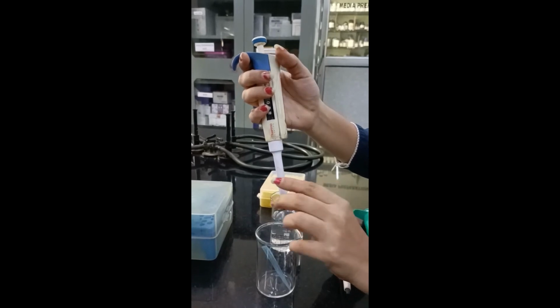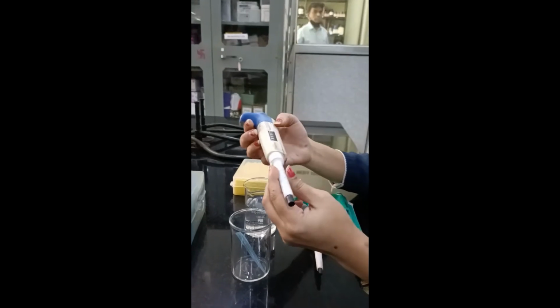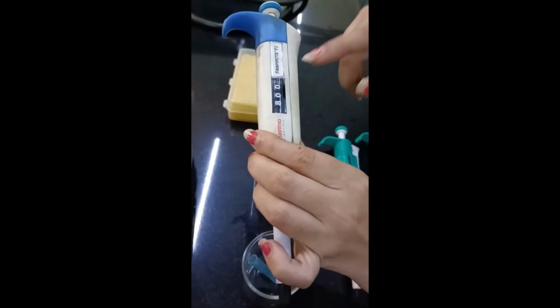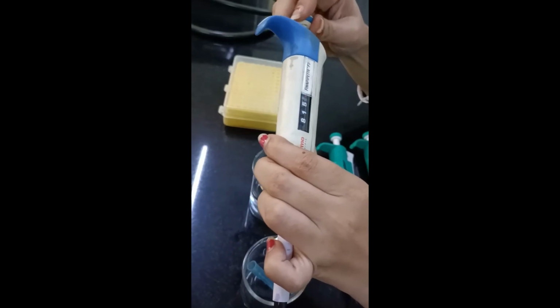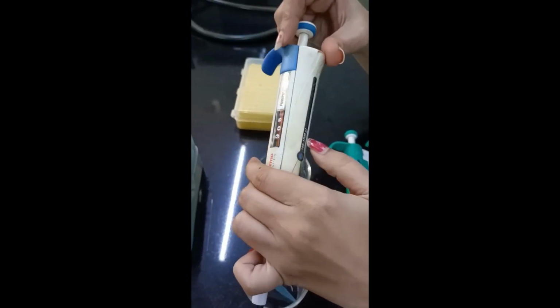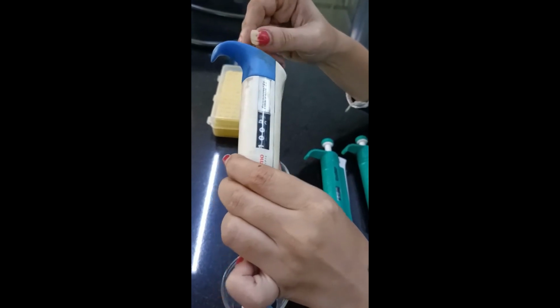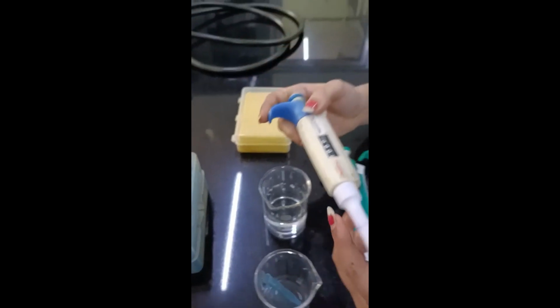So this is how exactly the micropipette works and how it is handled. As you are done working with your micropipette, you need to release the pressure which you applied to set the particular volume, by moving it back to the 1000 volume with respect to that particular micropipette, that is 1000. Done with it.